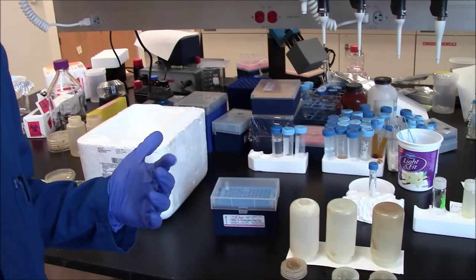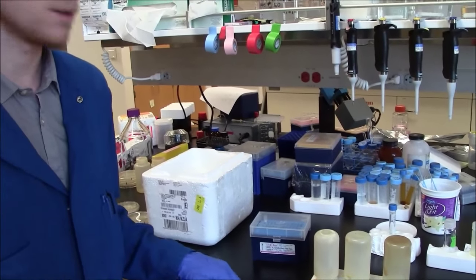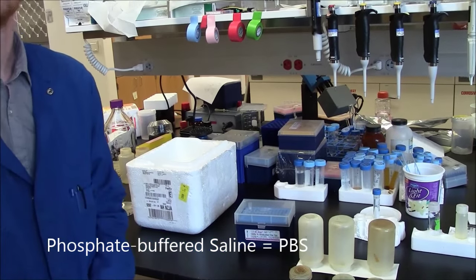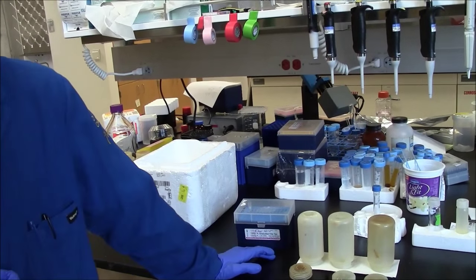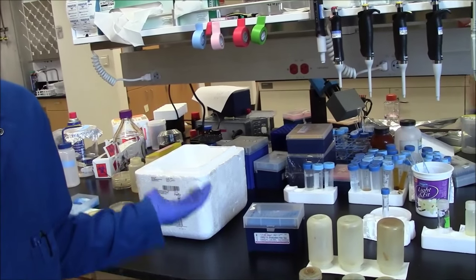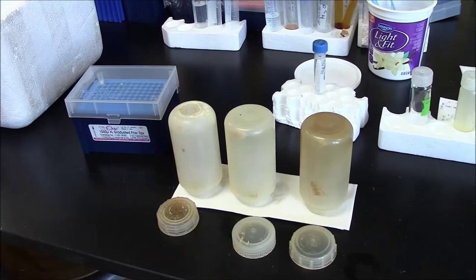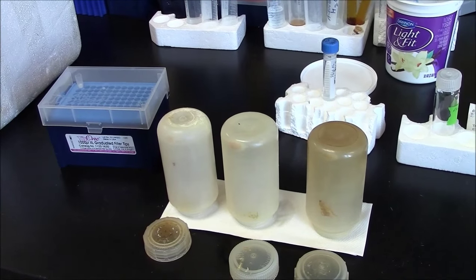For us, we would resuspend these phage pellets in phosphate buffered saline, abbreviated PBS, and you'd want to use maybe 2 or 3 or 4 milliliters of phosphate buffered saline to redissolve your pellet. And then we check the actual concentration of the phage using the spectrophotometer, looking for absorbance at 268 nanometers, a peak at 268 nanometers. We can use that to quantitate the phage yield.